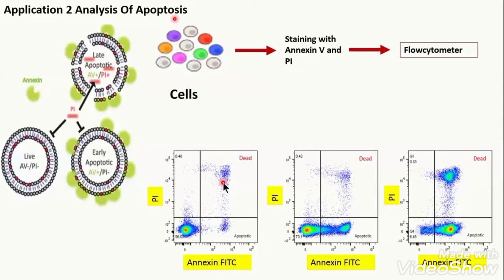So by analyzing the cell death, we can find out whether the drug is killing the cells or not. And secondly, by this application, we can find out whether the cells are dying because of apoptosis or not. Right. Now, how to achieve that? So I just go with the basic fundamentals, as I always tell people that before designing the experiment, it is very important to analyze the biology behind the experiment.